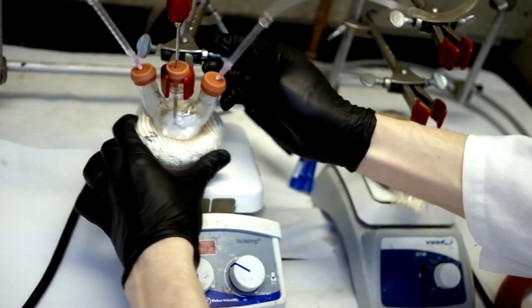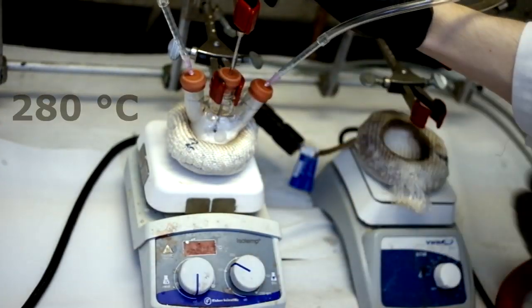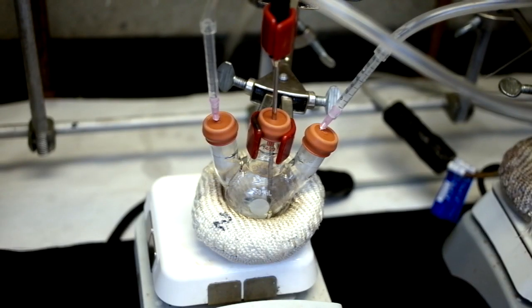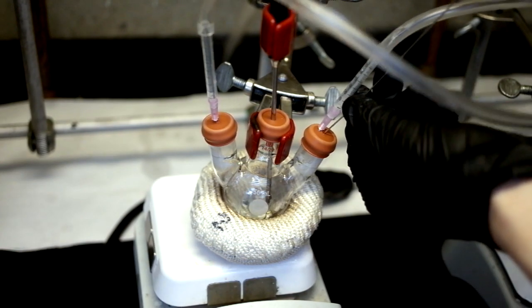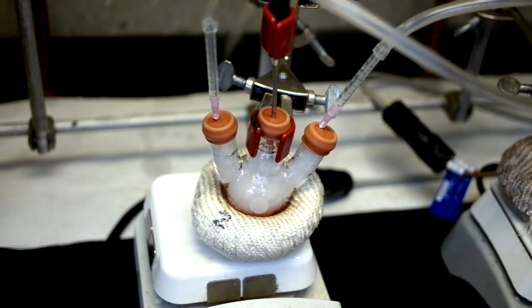Return the flask to the heat mantle and heat the reaction flask to 280 degrees centigrade. After the solution has turned clear in the reaction flask, inject all of your selenium precursor at once. The reaction will begin immediately.